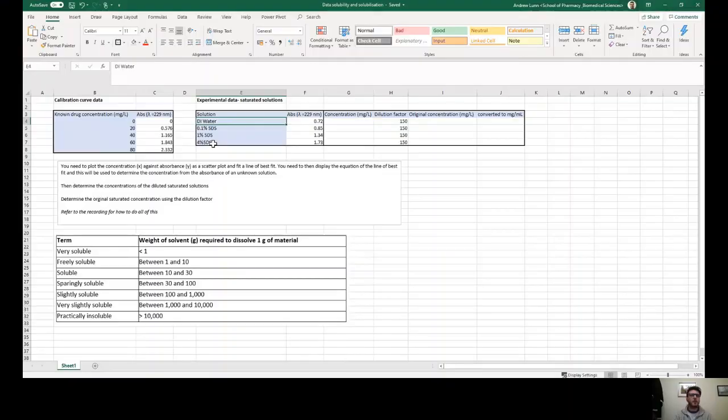So what I'll do is I'll share my screen with you, which has the spreadsheet of all of the results on, and you also should find you have the results in the relevant folder online, or they are just in the video earlier, and so you can note those down depending on how you're viewing this and what you've got access to. So I'll just share my screen now.